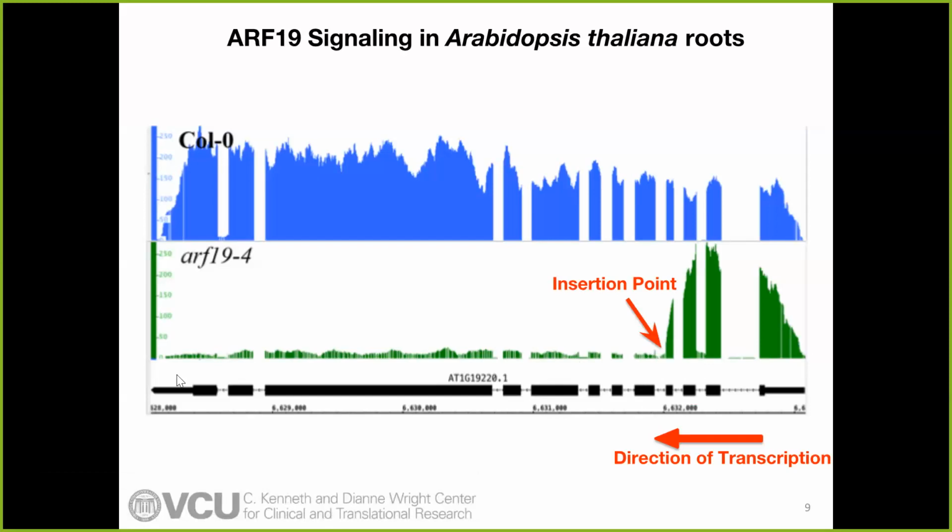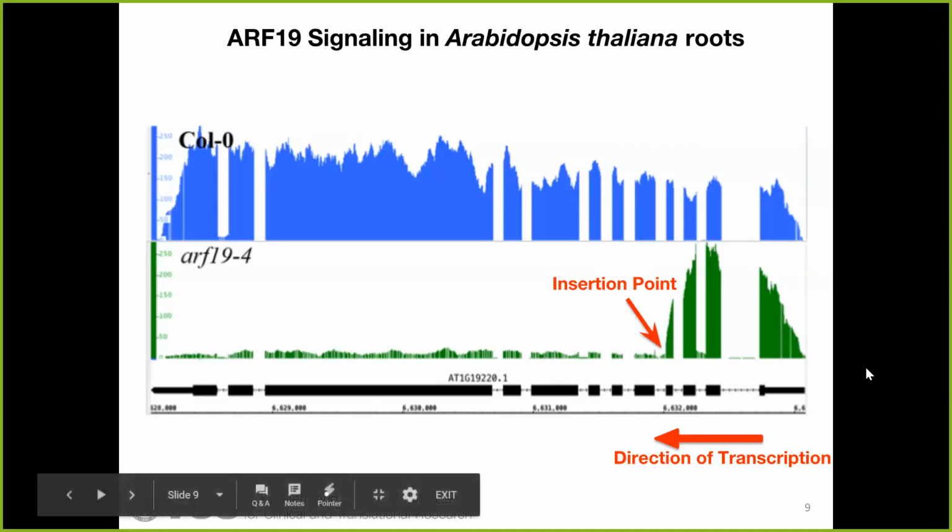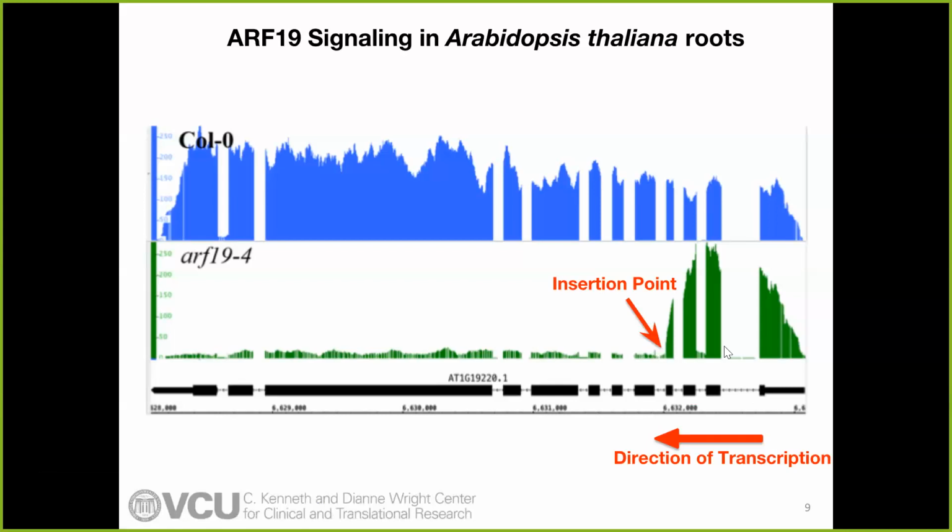So the conclusion here was, and I had the biologists investigate this, is this actually a functional transcript? Is it doing anything in the cell? And the conclusion from the research was, no, this is not a functional transcript. So we can say with confidence now that our knockout procedure actually did work. So we got some odd data, and we were like, why?